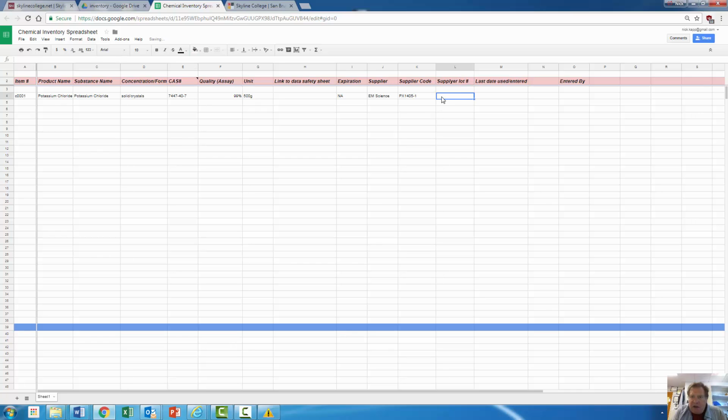Okay, and this particular number is 411555133. And so again, you'll often have a lot number that's specifically on there, and last date entered. So it's new. So I'm going to put down 08/17/27, entered by your initials NK.